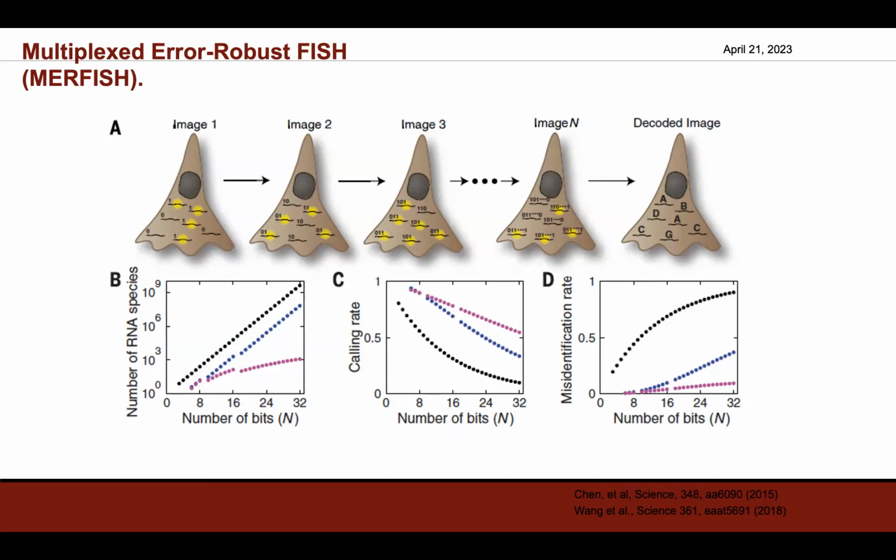Secondly, the reason they call it the error robust design is that when designing the FISH probes, the sequence of the probes for each RNA molecule has a tolerance. So they leverage some algorithms from binary computing, which very significantly reduces the error when you code the sample. In that way, it significantly reduces the misidentification rate of the detection. And this is a reasonable and reliable approach.